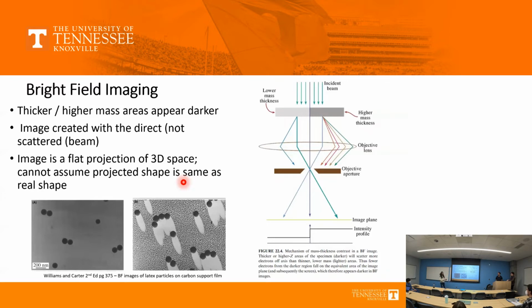And people who will be working with ferritic martensitic steel, your pressure vessel steel, which is like the majority of us, especially from Steve's group, they would be using this technique. So this was your sample, a beautiful sample in which you created these precipitates. You deposited a carbon film, then like a tracing paper, you take that carbon film out through etching. And this is what you're seeing. It's a technique that takes little mastery, but it's very common.